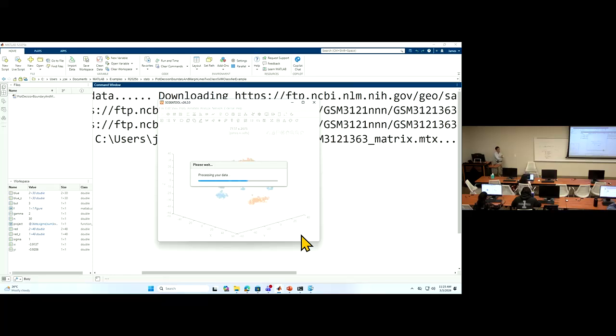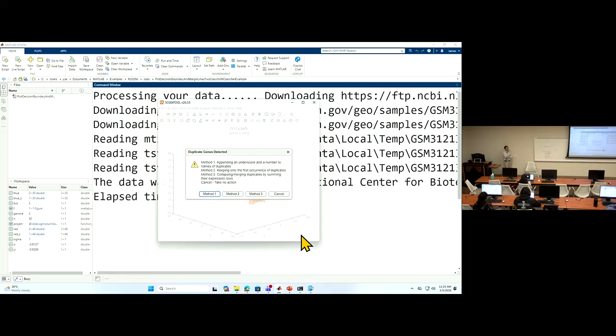So for the customized cell type annotation, this is applicable to the situation where you know what cell types are in your sample, so you know your marker genes as well. So you see, okay, I don't rely on public data information.